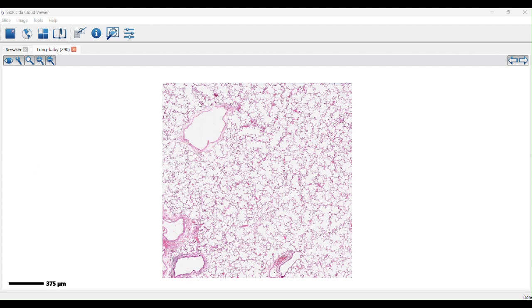So, what kind of tissue is this slide? This slide is related to our lungs. So we can see the net. It looks like a spider net. And every single circle represents one alveolus.